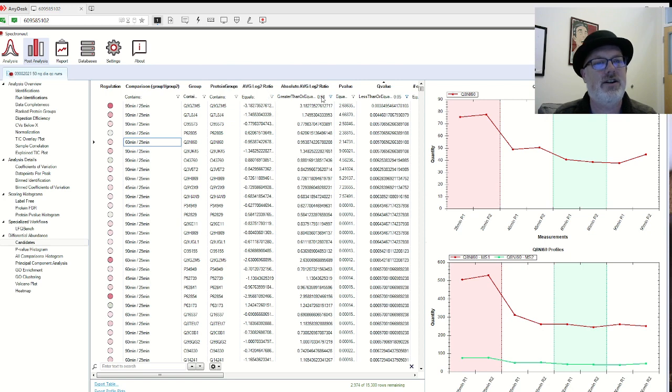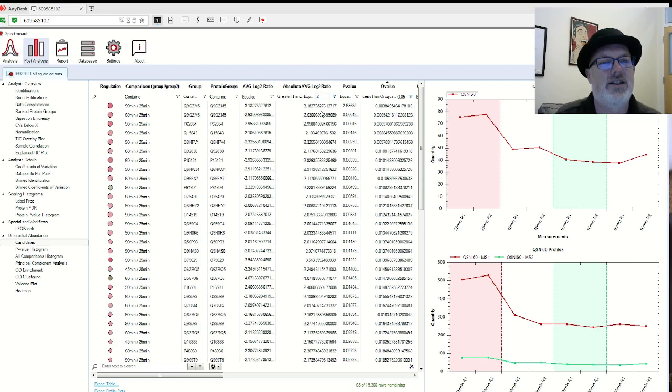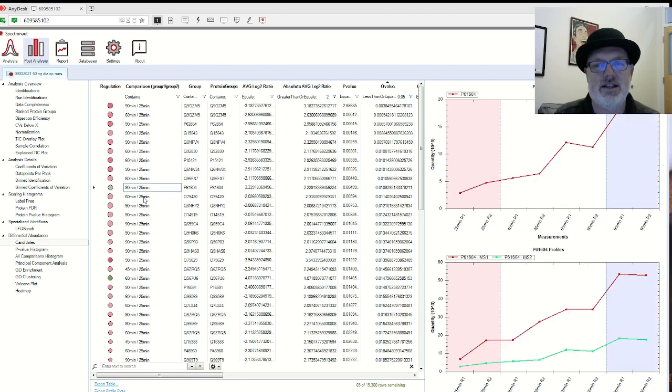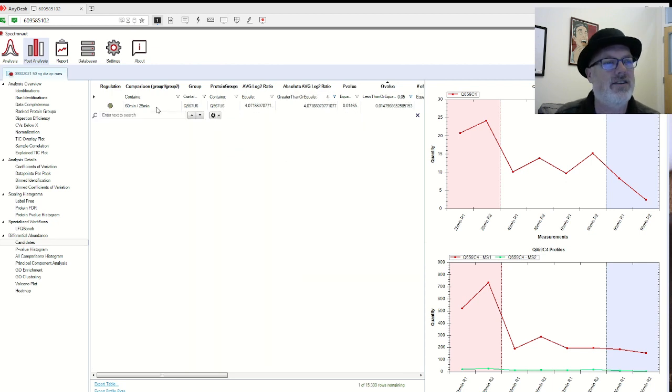So they do default. You can see there's a default here of the average log-2 ratio of 0.58, which is 1.5-fold change, right? Approximately 1.5-fold. So you can change this. Let's say you want to look at only things that are 2, like really different, and that changes here. So now we can find things that are really changing between the 2. And you can make these whatever you want. Like 4. Let's see. No, wait, look at that.